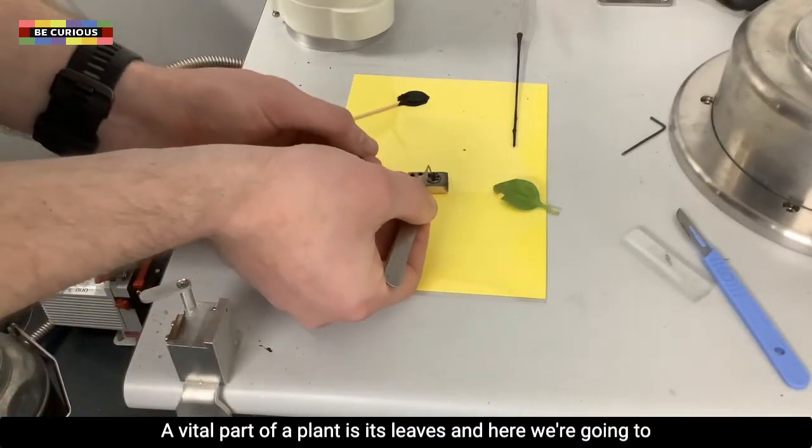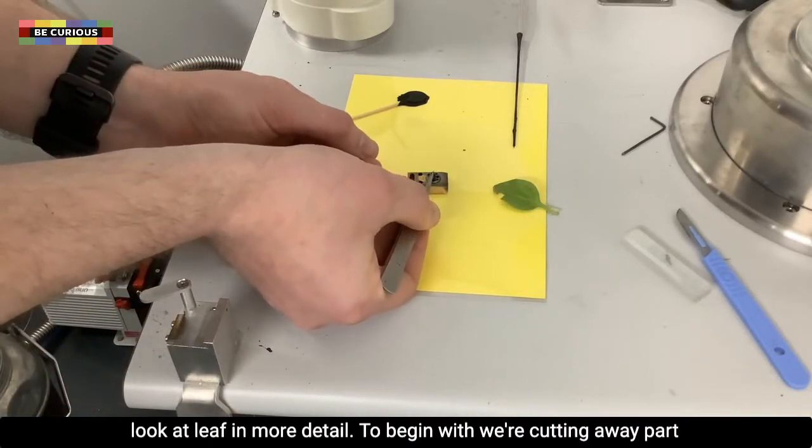A vital part of a plant is its leaves, and here we are going to look at a leaf in more detail.